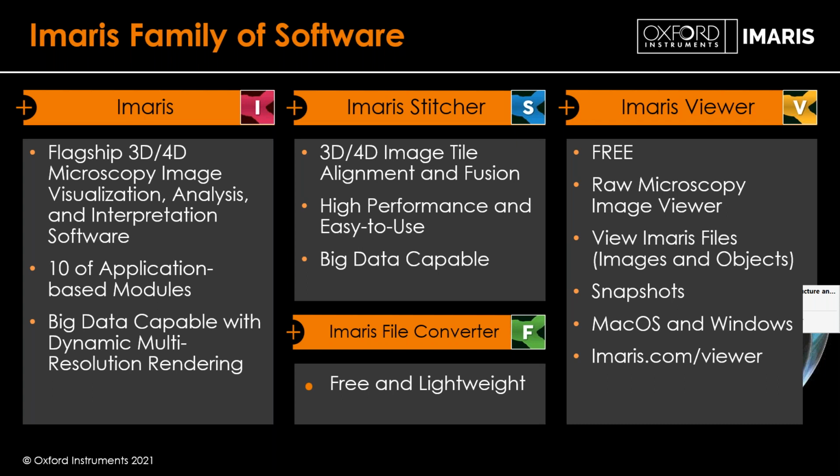And then we also have Imaris Viewer, which is another free software. It is a lot like Imaris. It now can become your raw microscopy image viewer. So you can use that to explore raw data sets as well as the Imaris files that you've gone in and analyzed. Again, that's free and also available from our website.